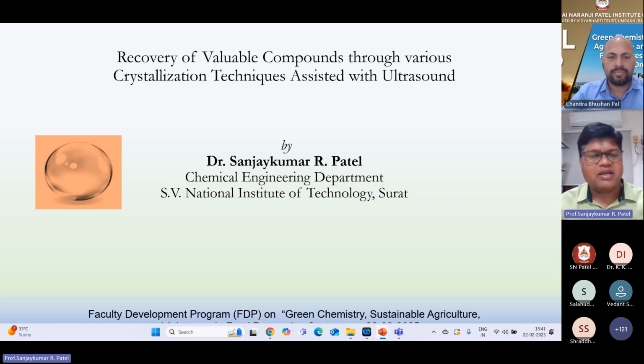techniques. Okay, and this crystallization technique would then be supported by another energy in the form of sound waves, which is known as ultrasound. So overall, the presentation would be coupling of this sound wave energy in a crystallization process for the enhancement of some valuable components, or you can say to tailor the product properties.